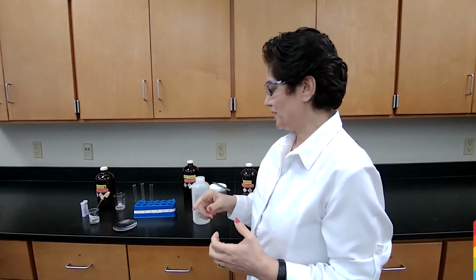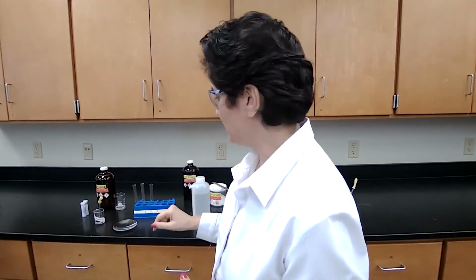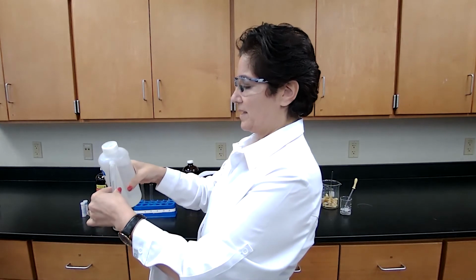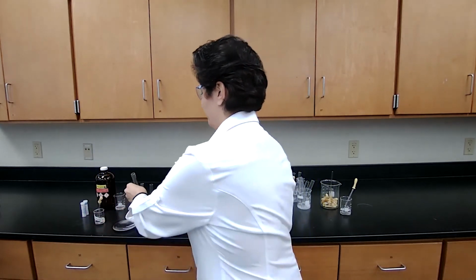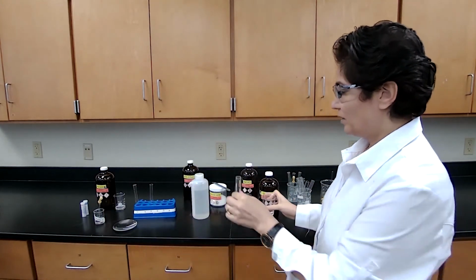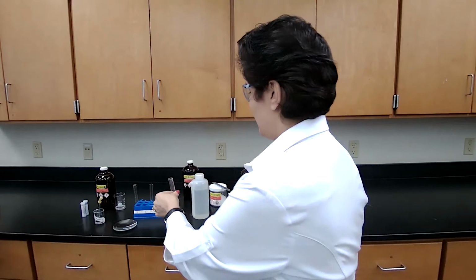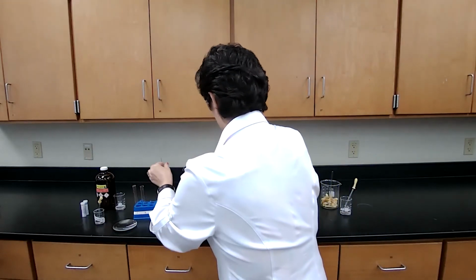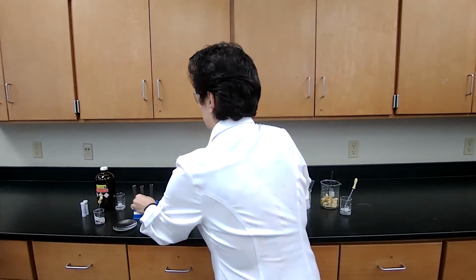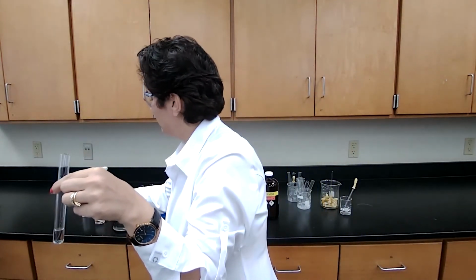Okay, now that we are done with the known samples, we are going to test our unknown. We have a liquid unknown for the solubility. We are going to test it in 3 different solvents. The first one was water. In water, so let me just add the solvents first. I have water, sodium hydroxide, and HCl. Okay. So the first test tube is water, and I'm going to add the unknown.